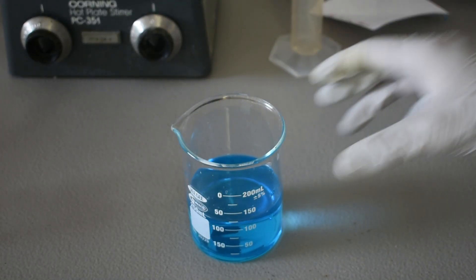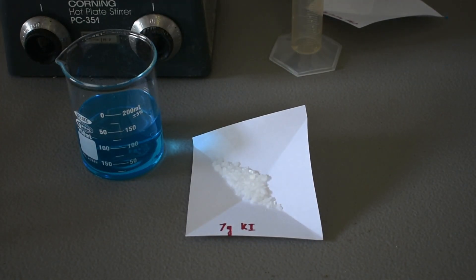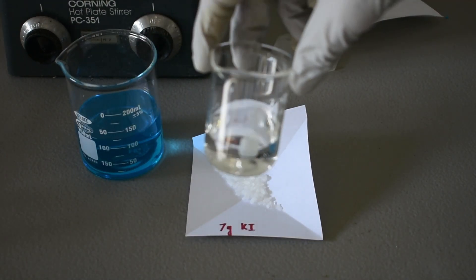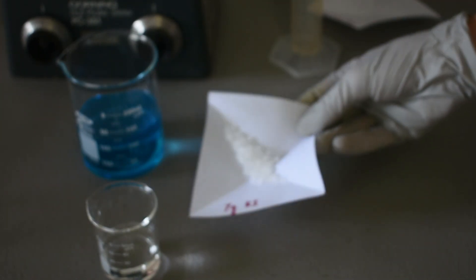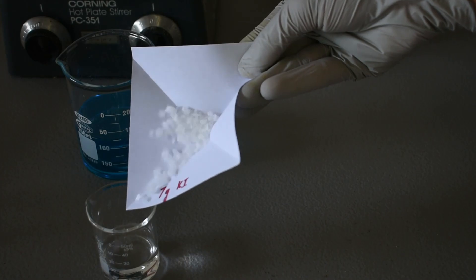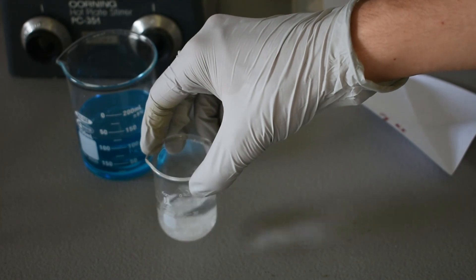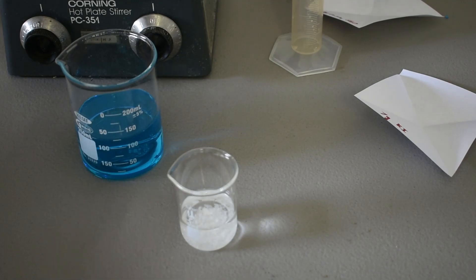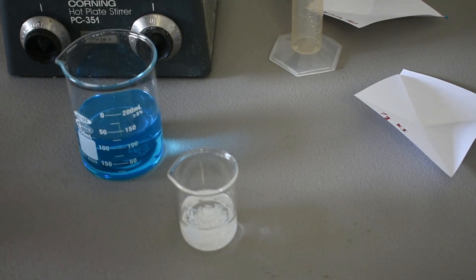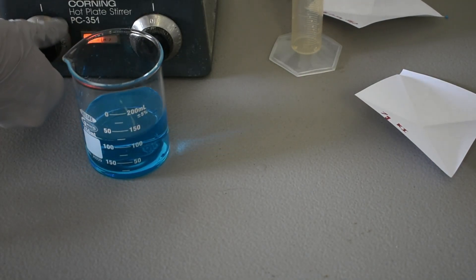And our next step is to dissolve our 7 grams of potassium iodide in 20 milliliters of water. And I have this little baby 50 milliliter beaker here. I'm going to add a little baby stir bar, and then we will proceed after this is dissolved.